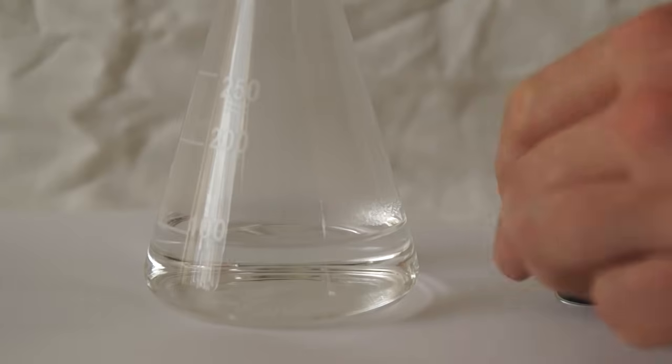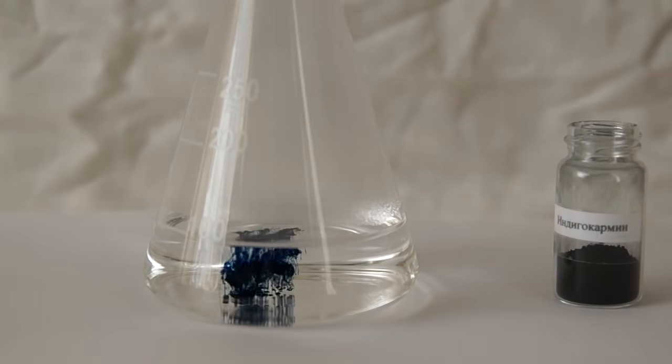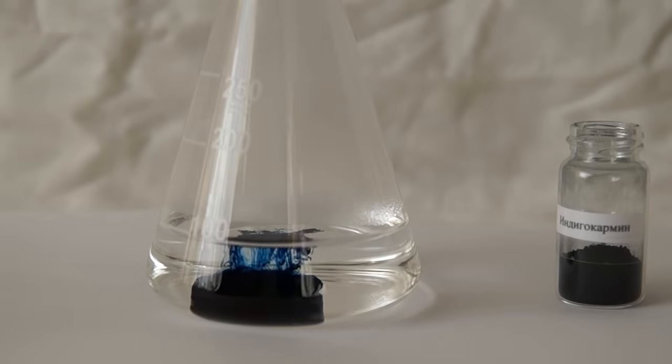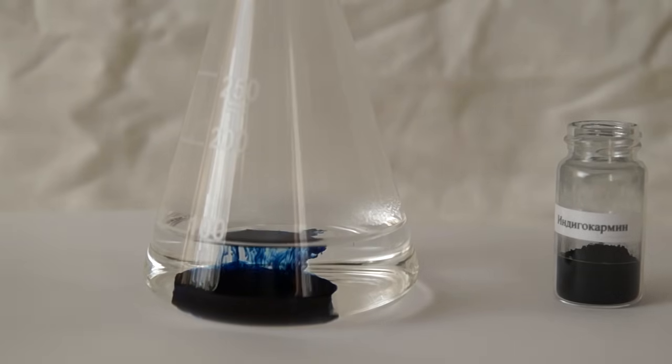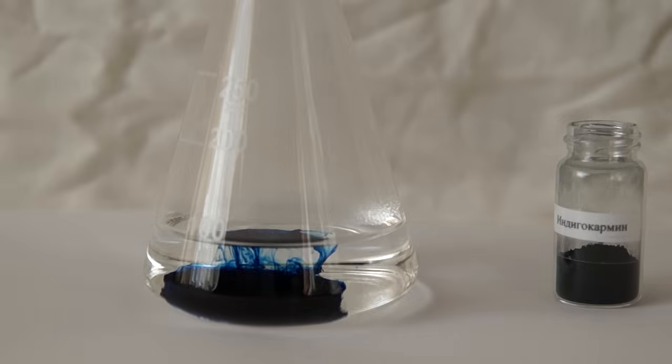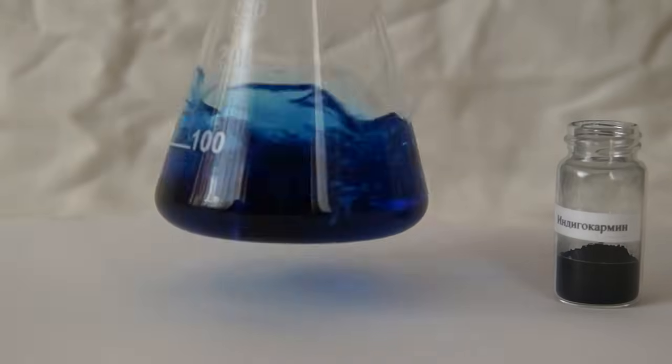To make the solution colorful, take a flask, fill it with hot water and pour there a small bit of soluble indicator called indigo carmine. The solution now becomes deep blue.